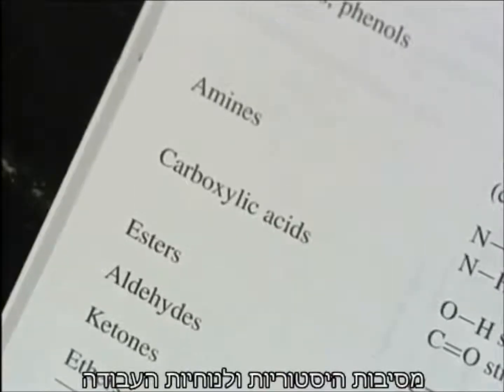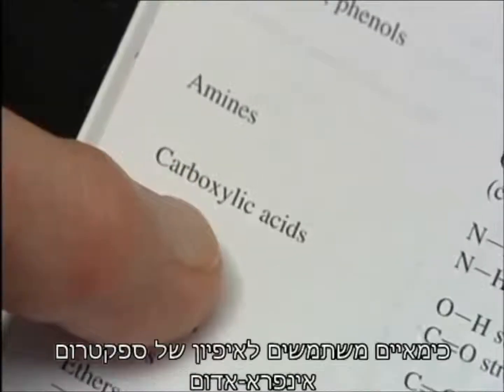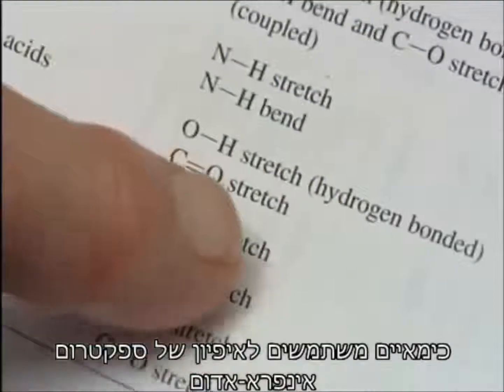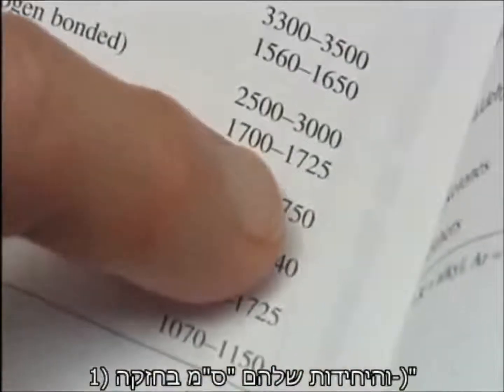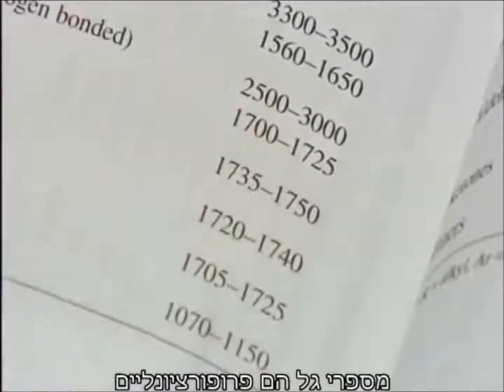For historical reasons, and because the numbers are easy to work with, chemists dealing with IR spectra use units called wave numbers, measured in centimetres to the -1, which are proportional to frequency.